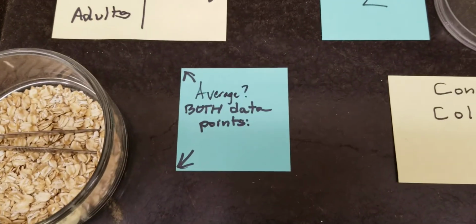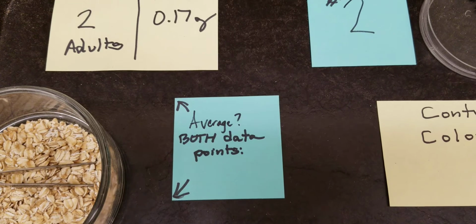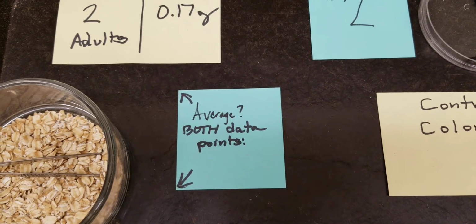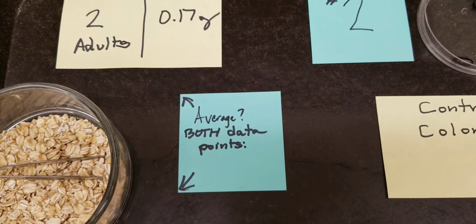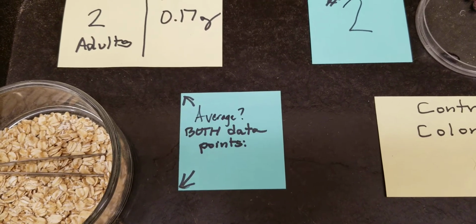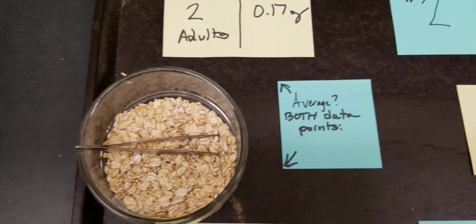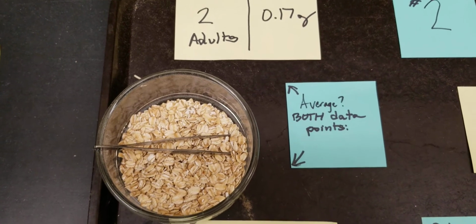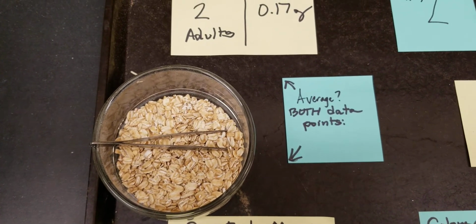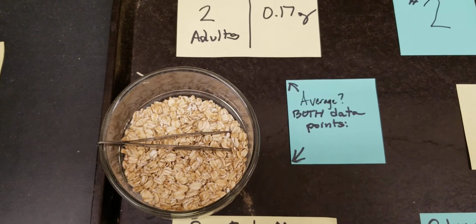What you want to do would be, of course, in the case of this month for the control colony 1 and 2, but there's nothing to average, but we would normally average both the count and the mass between those 2 colonies. Quick reminder that the colonies that we call the control colonies are getting a normal food source. I will in fact be feeding them this afternoon, so they get a scoop per month that goes into each bucket.